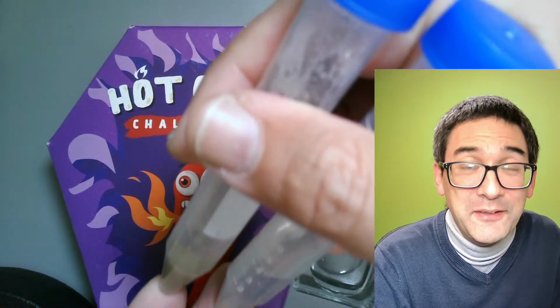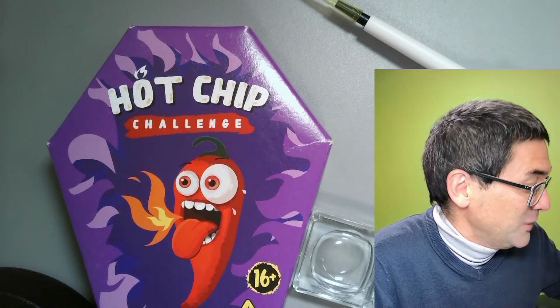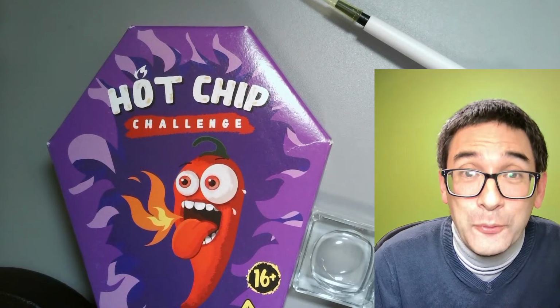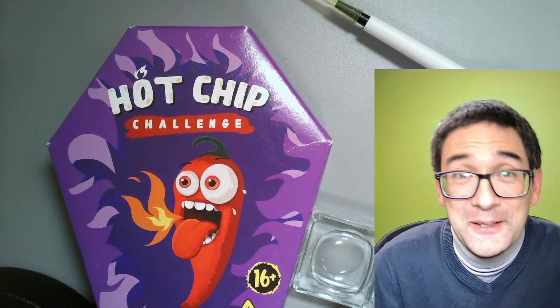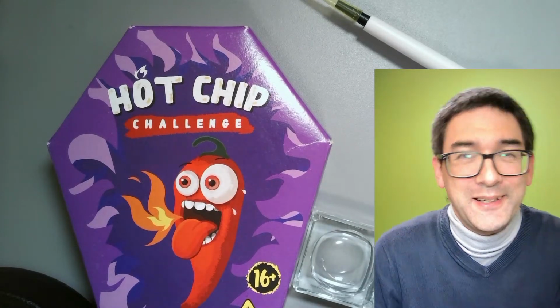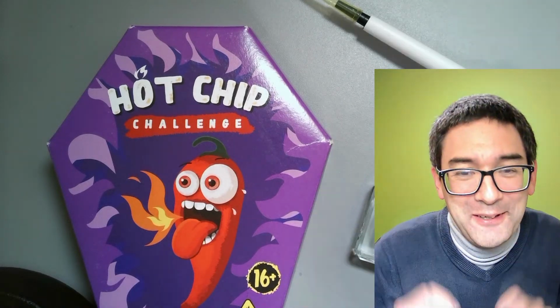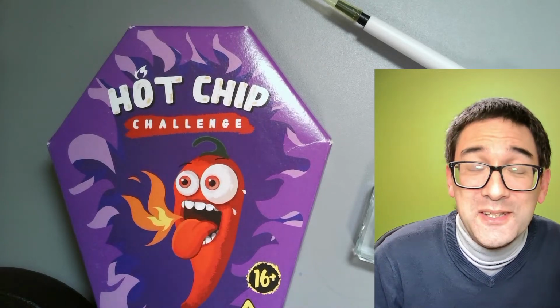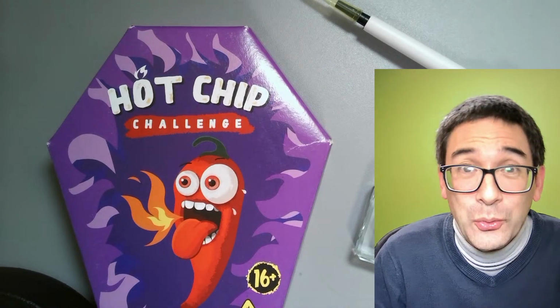So I'm going to leave this for a later episode, and therefore the slightly crazy thing today is that I would like to do this hot chip challenge, but I'm not going to eat this stuff. I'm going to mix it together with a couple of small worms, microorganisms maybe, and see what happens. So that's a little bit more on the fun side. It's not very scientific, I understand, but in any case, I want to give it a try, and we're going to see what happens. This also gives us the possibility to observe again a few live microscopic animals or microorganisms as well.